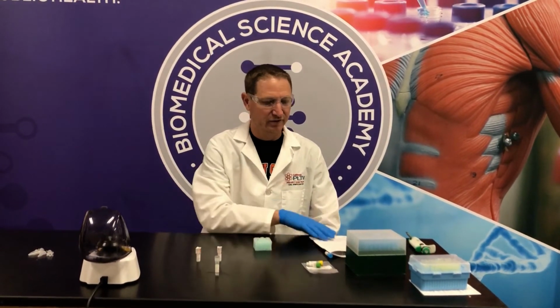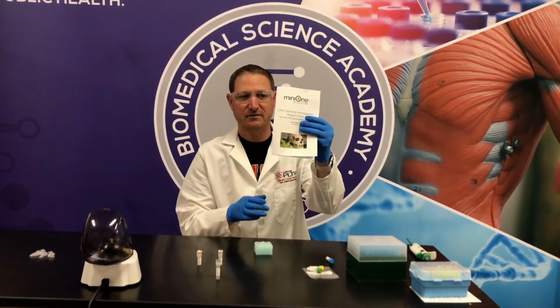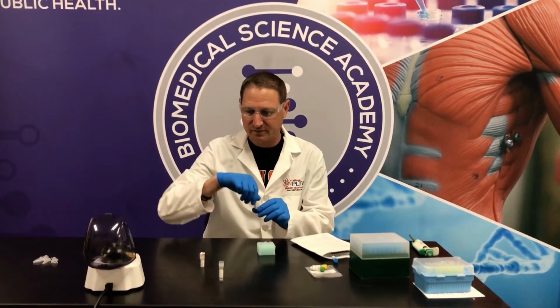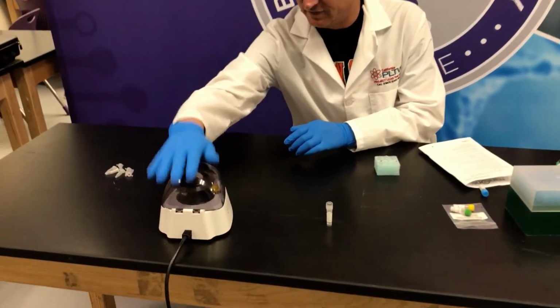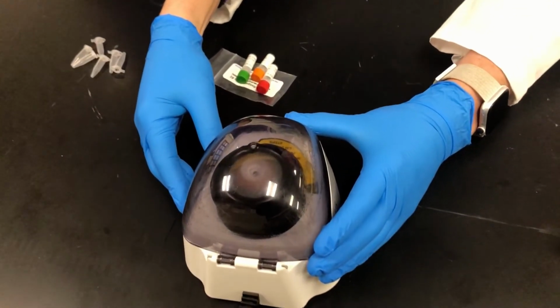So the first thing I'm going to do is, in my packet comes a mini 1 directions, and so I'm going to have these handy, but I'm going to walk you through these as well. First, I'm going to find my EcoRV and my HIN3, and I'm just going to centrifuge these down to make sure everything's at the bottom. About 30 seconds.